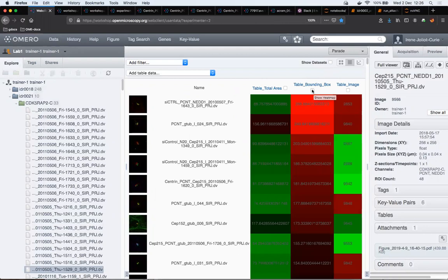Peter, sorry, can you show again how to add more filters? Christina missed that. Yes, so I am adding a filter. Okay, so here. So for example, I can filter for... You're in the middle tab already. Is it? Yeah, continue. Sorry. So filter addition is here, okay?